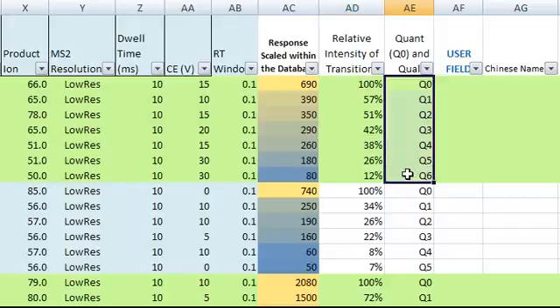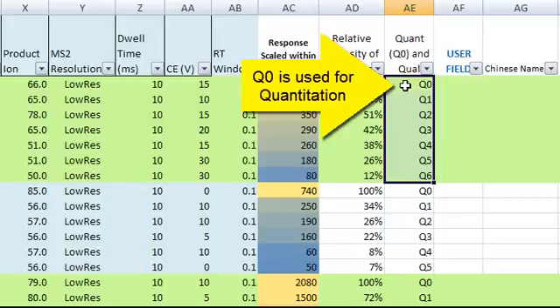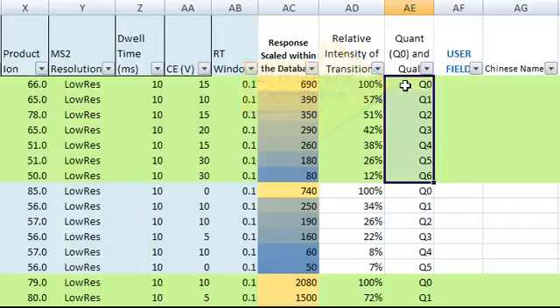Based on the relative responses, we label all transitions as Q0, Q1, Q2, and so on. Q0 is usually used for quantitation. In this example, you have seven transitions for picoline to work around matrix interferences.